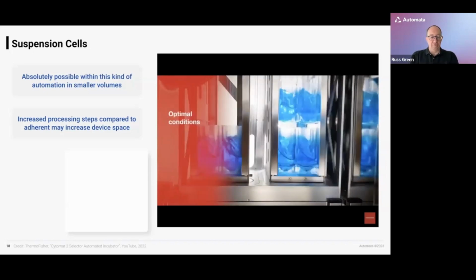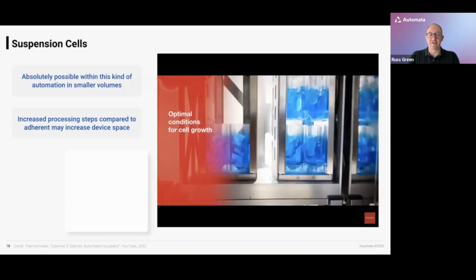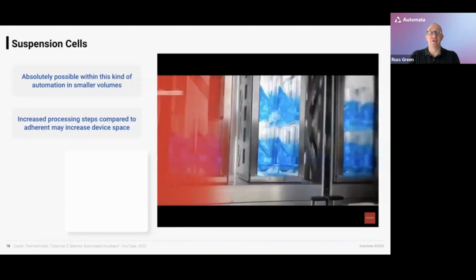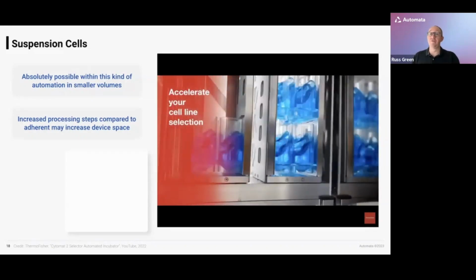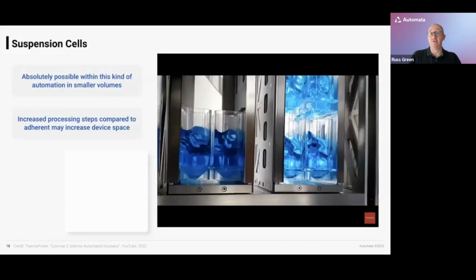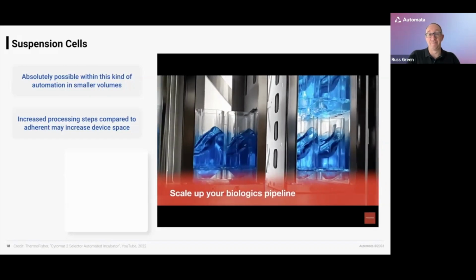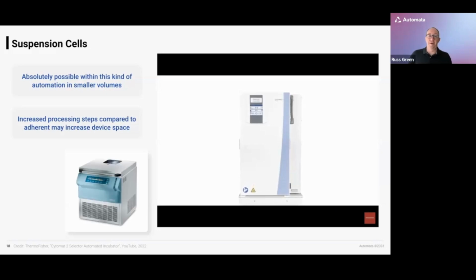I don't have video footage of this, but I showed the Kuhner incubators earlier on, or that type of incubator, and there are now automated versions of those as well, which have automatic doors and lock the bed into place, so we can access them with a robotic gripper and start loading other pieces of labware into this automated system. Of course, there are all these other process steps we have to think about as well.